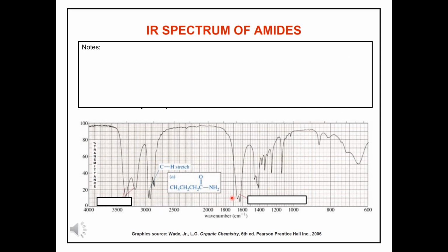The final functional group under consideration that contains the carbonyl bond stretch are that of the amides. The amides will contain nitrogen-hydrogen bond stretches as well as the carbonyl bond stretch. And the carbonyl bond stretch is typically at a lower wave number than other carbonyl bonds, and this you can see in your data table. But what makes this easy to recognize as a primary amide is that molar tooth appearance between 3200 and 3600 that corresponds to nitrogen-hydrogen bond stretch.